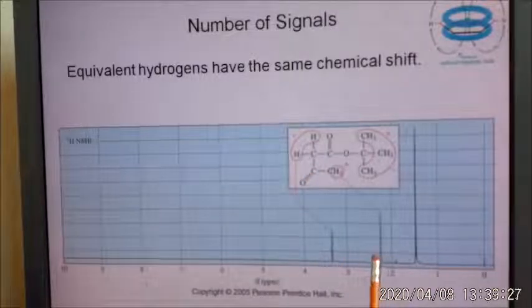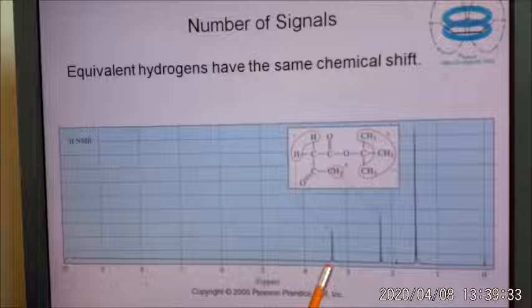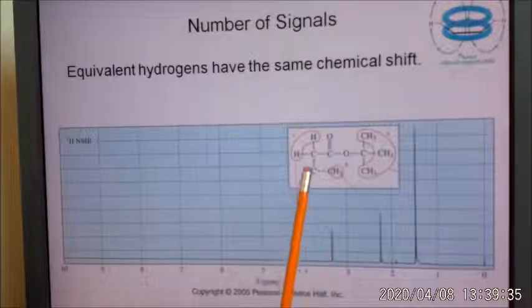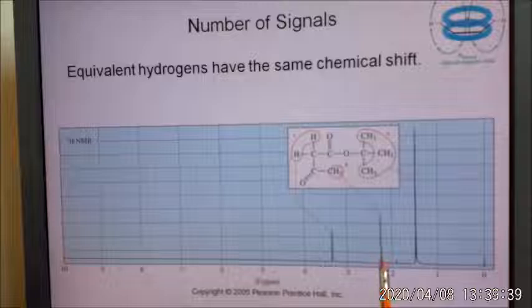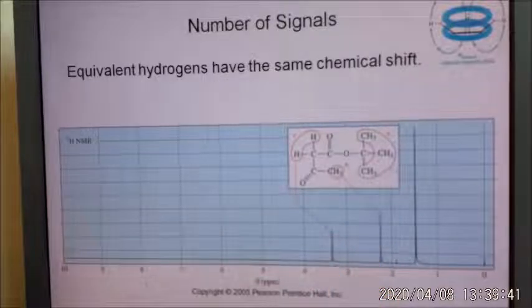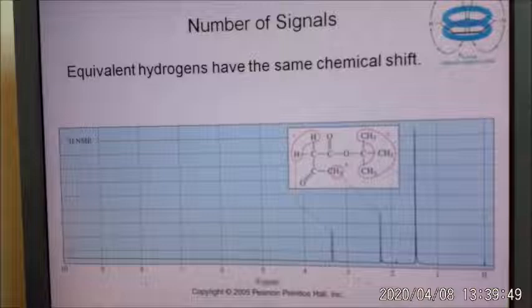Usually in this range, acetone is right, 2.4. Okay. Then at the 3.35 or so, look at, I'm between 2 carbonyls. 1 carbonyl right here. 2 carbonyls, another shift, about another 1 part per million chemical shift. Okay, so you can see the additive effects of electron withdrawing groups.